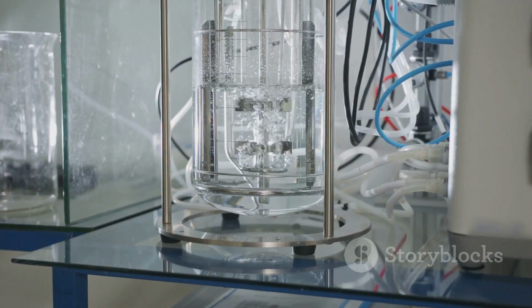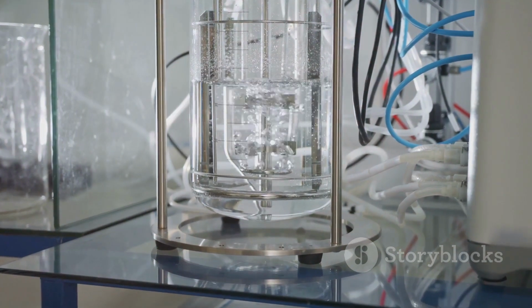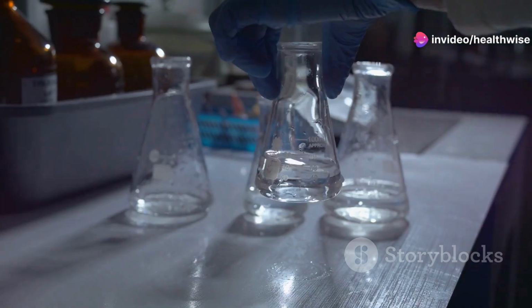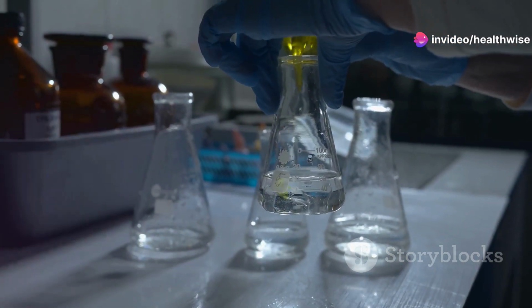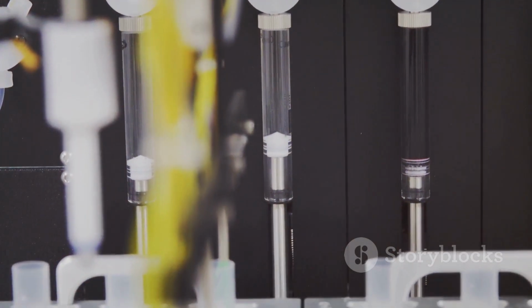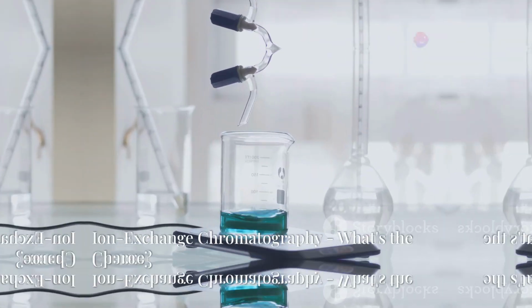Liquid chromatography is an analytical technique used to separate ions or molecules dissolved in a solvent. It's a critical process used in various scientific fields from pharmaceuticals to environmental science. Stay tuned to learn about the different types of liquid chromatography, how they work, and their amazing applications.